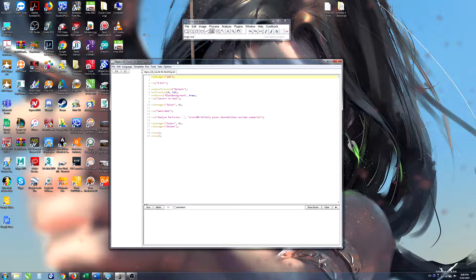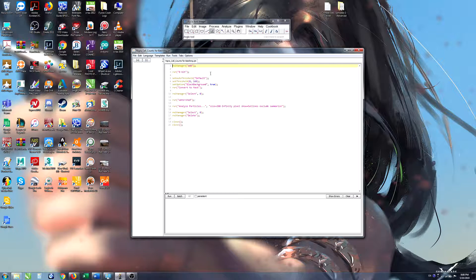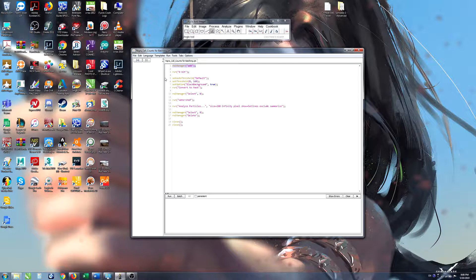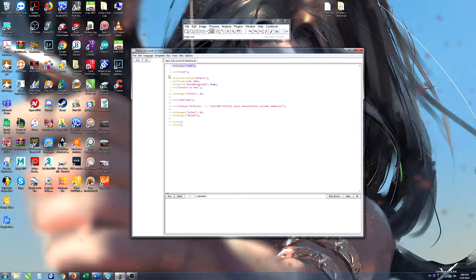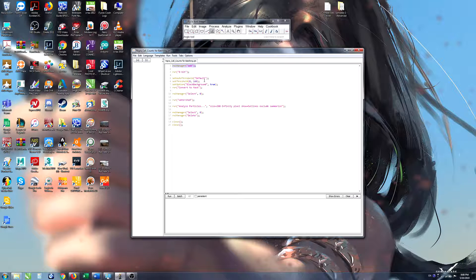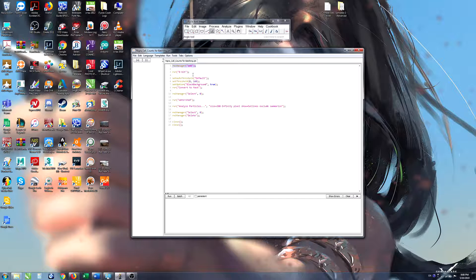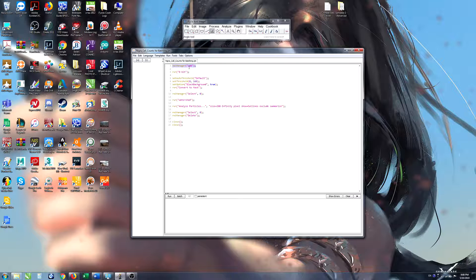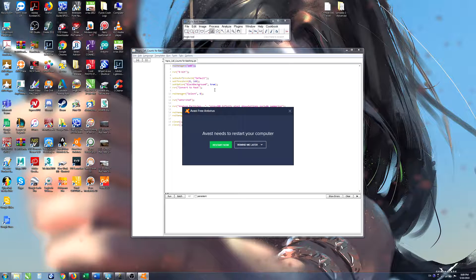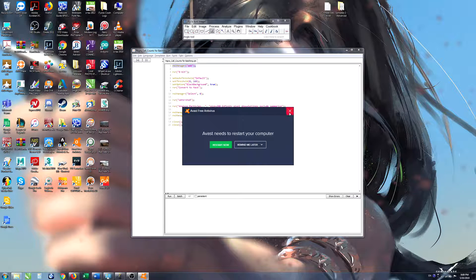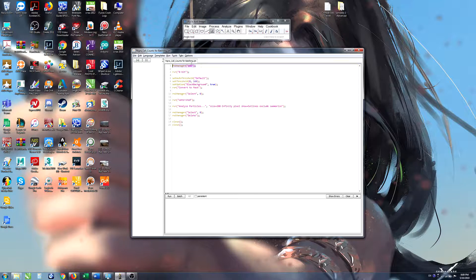But the actual macro itself, the actual analysis of each of the images gets performed here. Now the functions that are called for in the macro are functions of ImageJ. As a general rule, the macro then specifies a function and then there's a bunch of settings which are usually written in pink in between inverted commas, and the series of functions that are necessary in order to analyze each of the images are then performed. Let's go through line by line to see what the macro is doing.